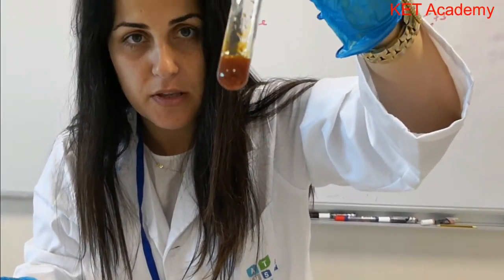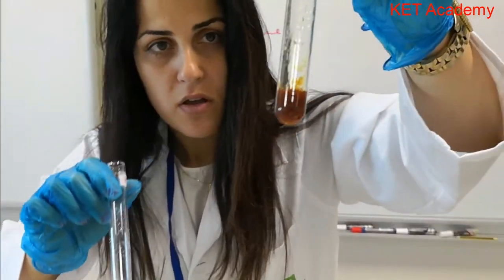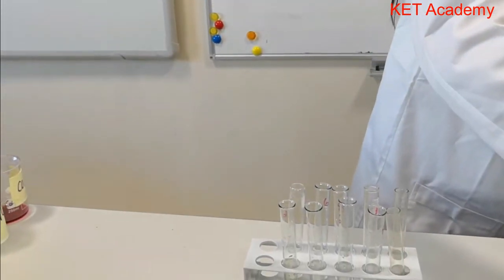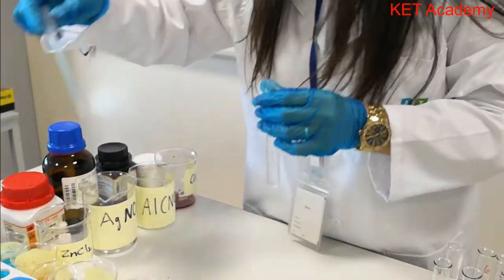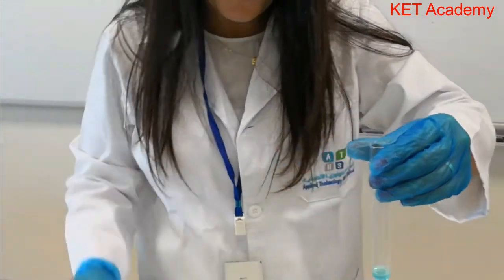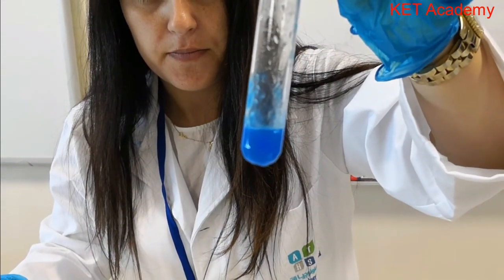My advice before you watch this video is that you take a note paper and jot down some important points, especially for the first part of the video. Also take note when the instructions mention an excess of reagent. I want to emphasize this point, because when I was doing my own experiment, I think this part also came, and many people failed because they didn't add excess of it. So please always make sure to follow instructions. It's very easy, it's very normal. Okay, let's get into the video.